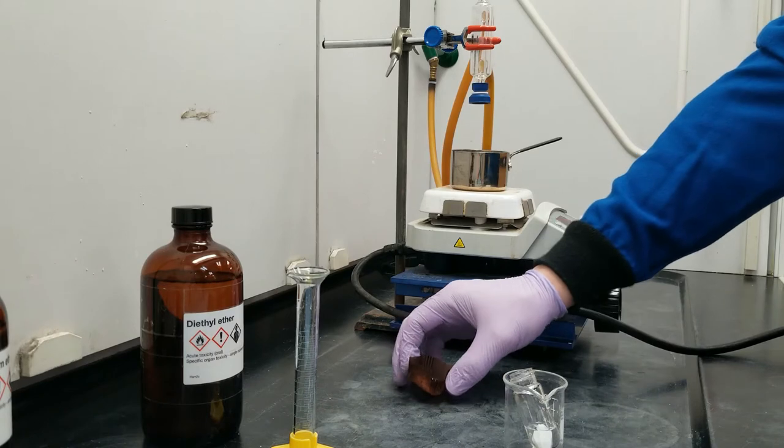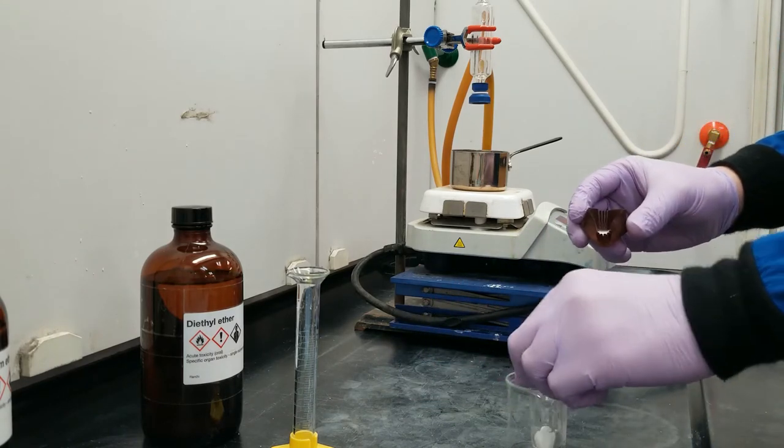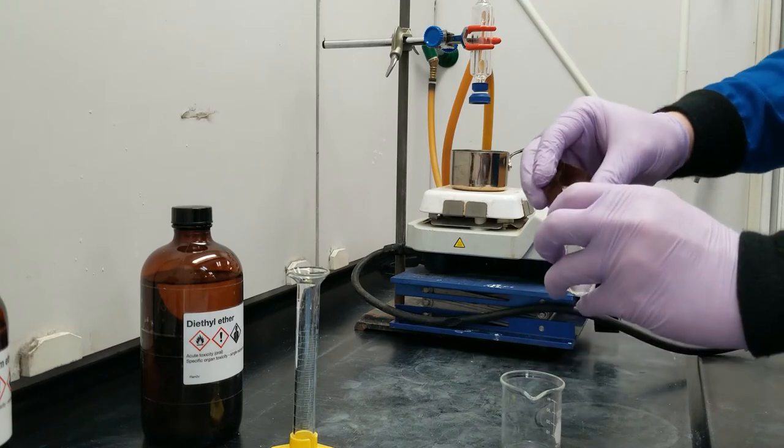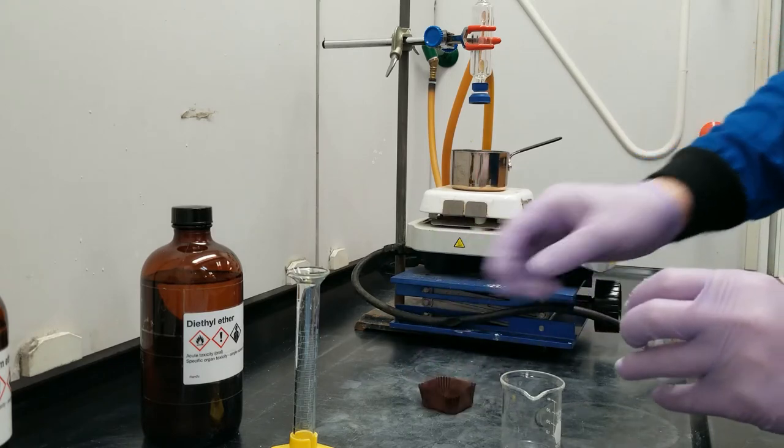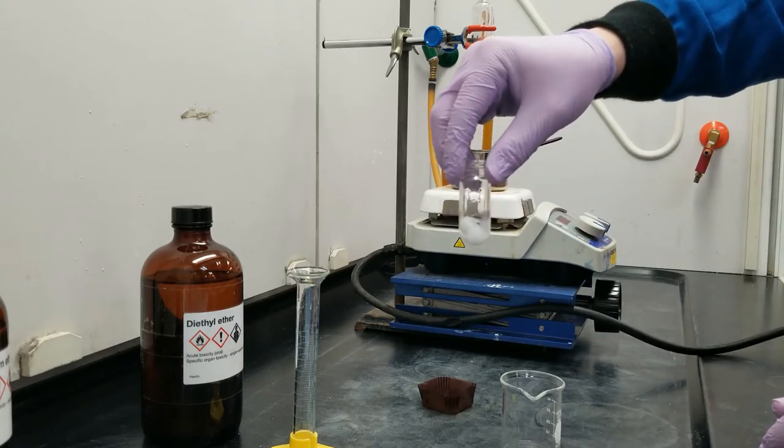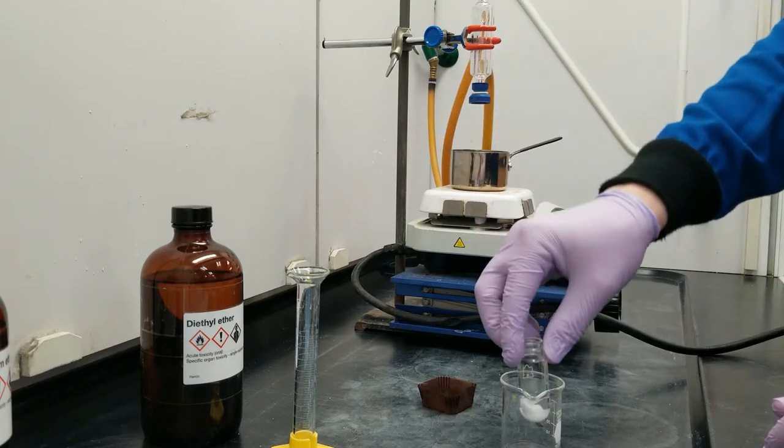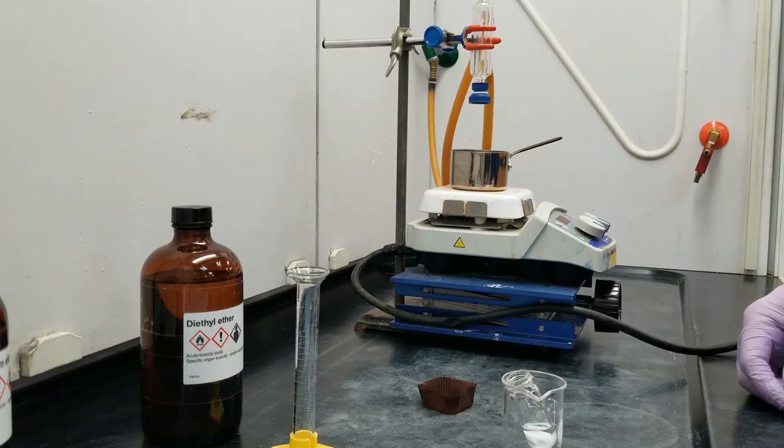Finally, I'm going to add the maleic anhydride. About 0.4 grams of it. It's not going to dissolve immediately, but what we're going to do in order to dissolve everything, as well as get the reaction going, is put it on heat.